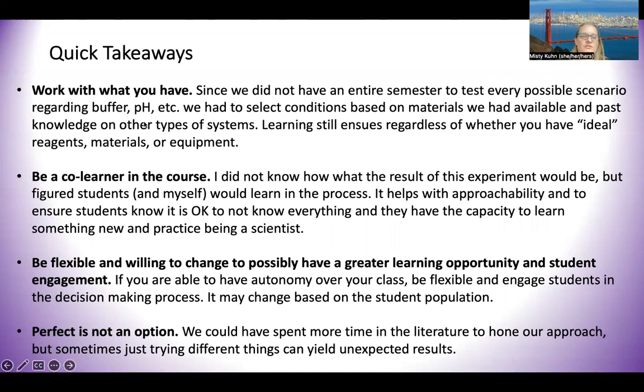I think one really important thing is to work with what you have. We really didn't go into this having a perfect plan at the very beginning, and we were limited based off of the kinds of buffers that we had and the different kinds of columns. We did have a lot because I had some extra things from when I first started my lab, a bunch of different columns that we could use in the teaching lab itself. But I think it's important to keep in mind that a lot of times you can actually do quite a bit with limited resources. So, we didn't test every possible scenario of different buffers and pHs and those kinds of things, but we found enough of a result that we could then build a project out of it.